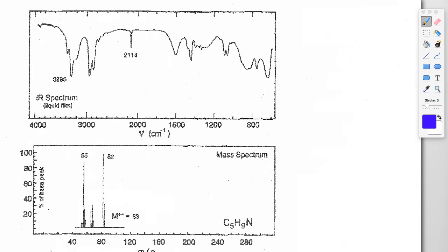And in today's episode, we are going to be solving another unknown in organic chemistry using various spectroscopy. So if you've been following along, we have been using degrees of unsaturation calculations coupled with mass spec, IR, and then the NMRs, including both carbon-13 and proton NMR. So that's what we're going to do here. We've got another unknown. So let's go ahead and get started with this.